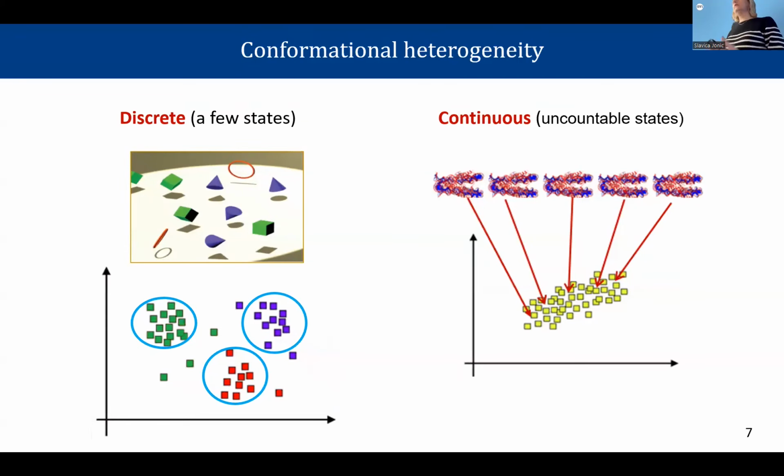And to get this 3D reconstruction at high resolution, it means that in each 3D reconstruction, we need to put a lot of particles. Typically, to get any reasonable shape, we need at least 1,000 particles. So if you want to get millions of different conformations, we need at minimum 1,000 particles per conformation. This increases the size of the data set that we need, really.